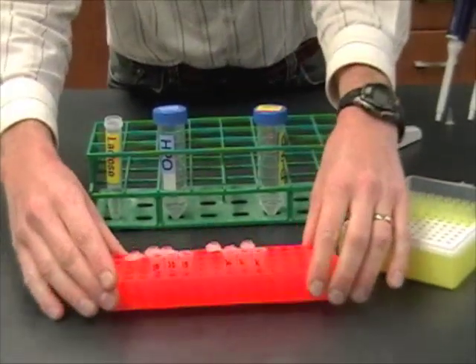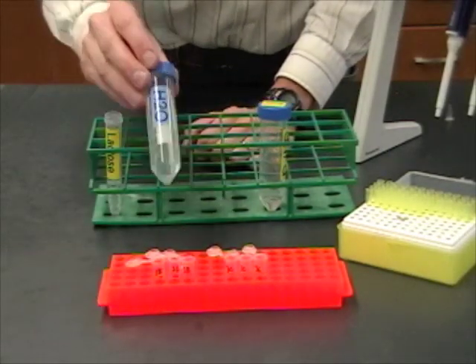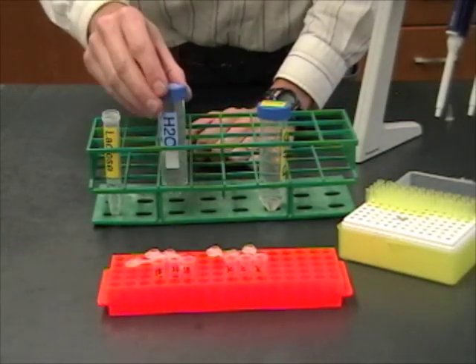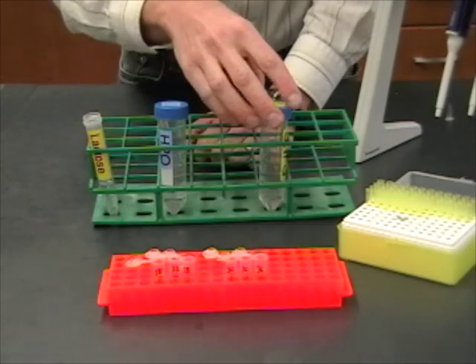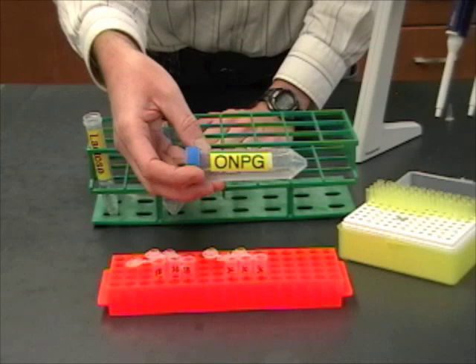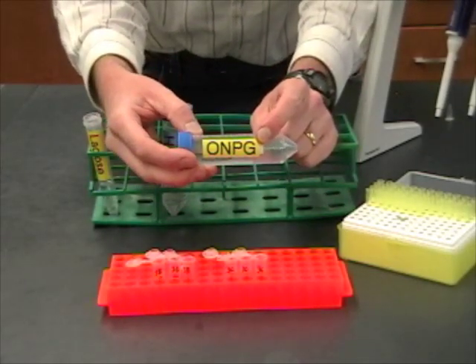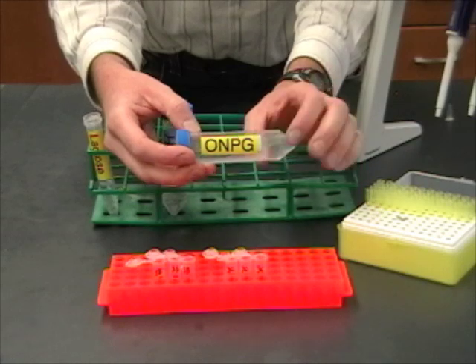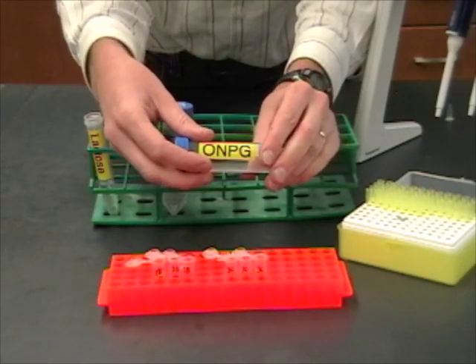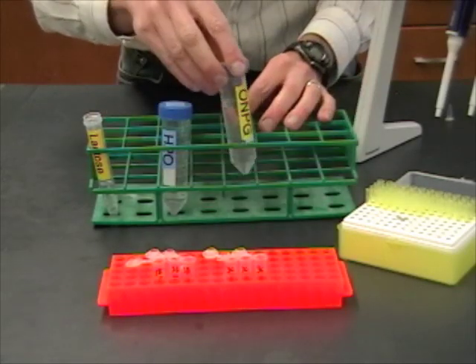At the moment these tubes don't have anything in them, but all the tubes labeled B need to get water — this is going to be the blank. And the tubes that have C in them are going to get ONPG. That's an abbreviation for a long chemical name, but this is the substrate for the beta-galactosidase enzyme. If beta-galactosidase is being expressed by the bacteria, it's going to react with this, and that's going to produce a color change that we can watch in the spectrophotometer.